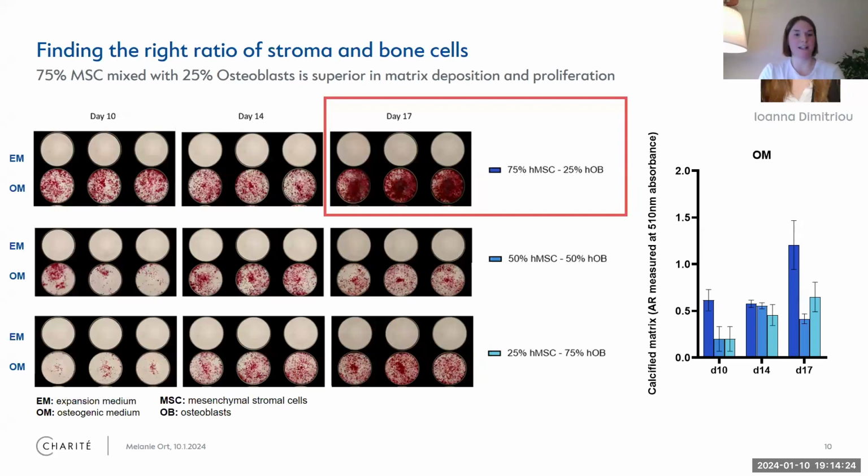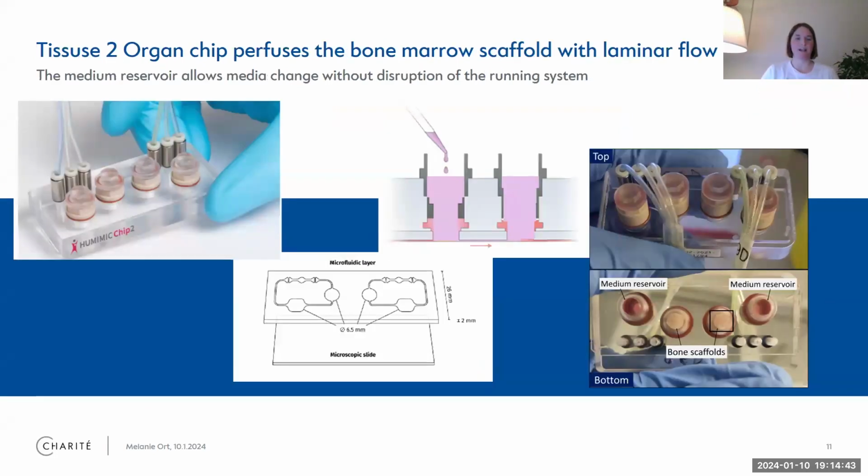This was really nice, and it's just to illustrate that you always have to think in different layers. In this case, Annie showed that this was a nice mixture that you can then use in 3D, because it would be sad if you do all the work putting the stuff in 3D if it doesn't already work in 2D. So now, this is called on a chip. So I proudly present the chip.